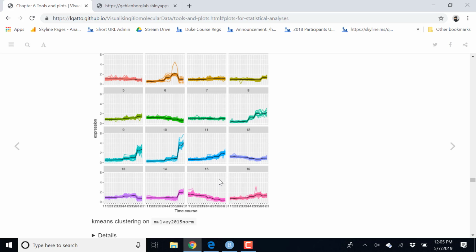So this is the expression intensity, and each colored line represents the expression pattern of one gene, and then the black one is, I think, a geom smooth, the mean of all the expressions. Yes, exactly. Something like what we did there, but done automatically with ggplot, with a geom smooth. These are all the proteins that are part of cluster 9. These numbers are completely arbitrary.